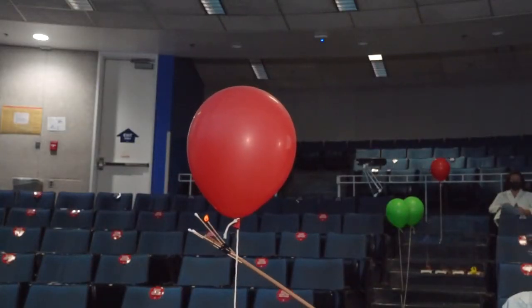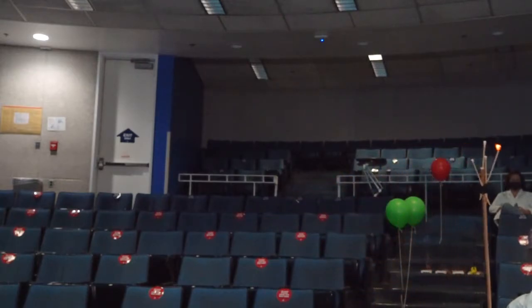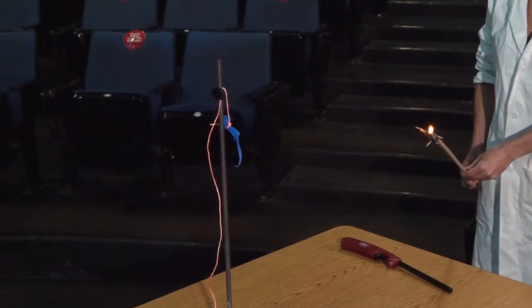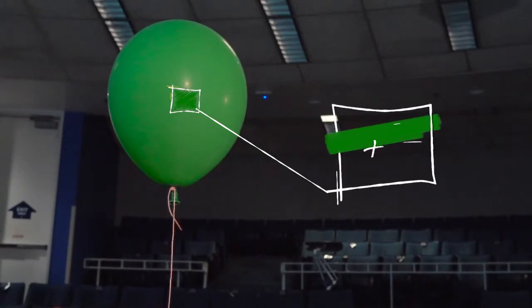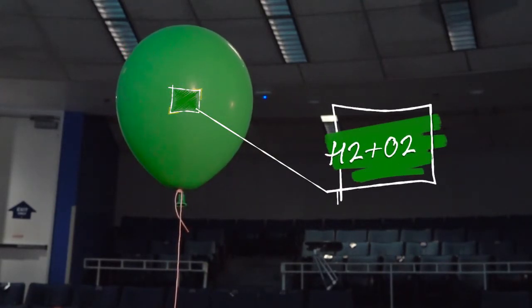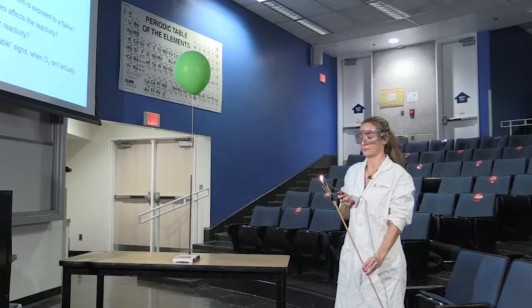And so what we saw was that the hydrogen balloon did combust. It fully reacted, whereas the oxygen balloon really didn't do much that was very impressive. So you might think, based on your logic, that now I've diluted my hydrogen, which was exciting, with the oxygen, which is not so much. So we might expect that this balloon won't actually be very impressive. So let's find out if our prediction is right.